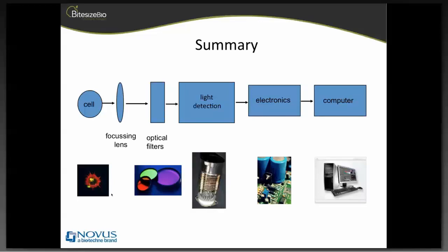Rachel, just to start it off, could you just briefly speak of some of the differences maybe between the main commercially available machines? There are differences in the fact that you've got some that are clinical, so they've been CE marked, which means that they have been checked that they can be used for clinical samples. There's also different types of lasers. There are some, such as the Cury, that have a set PMT voltage, and therefore you can just run your cells without having to set a voltage, and you can then just zoom into your data. So it has a 7 log decade dynamic range. It's important to work out what experiment you want to do to then look to see what machines you have and what's actually available.